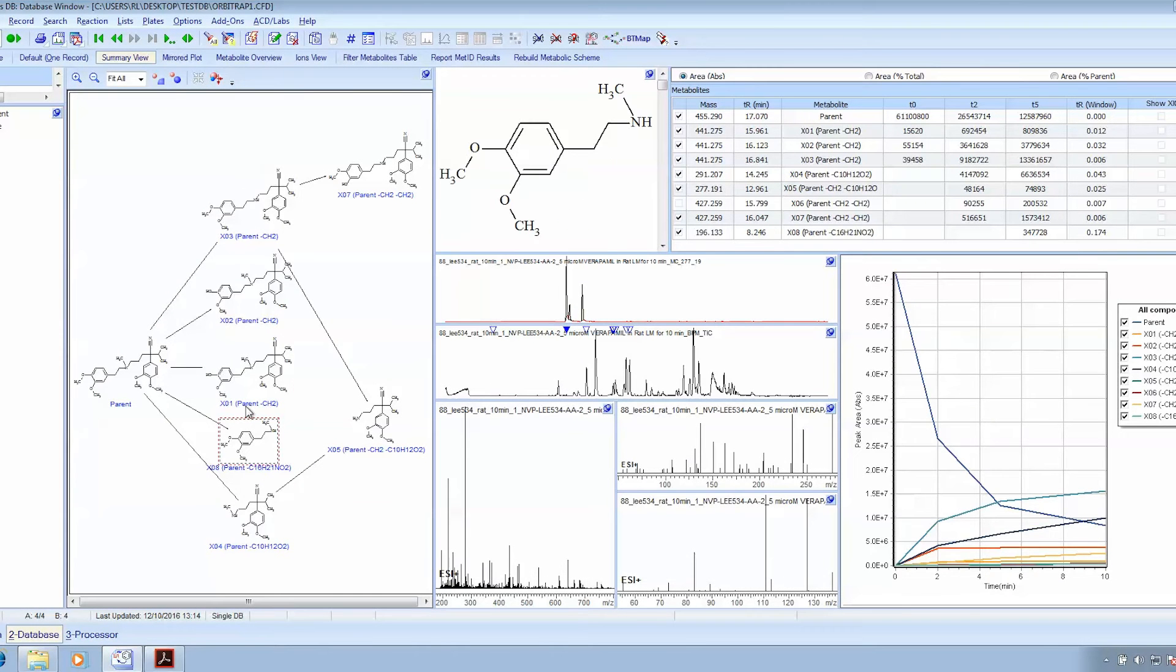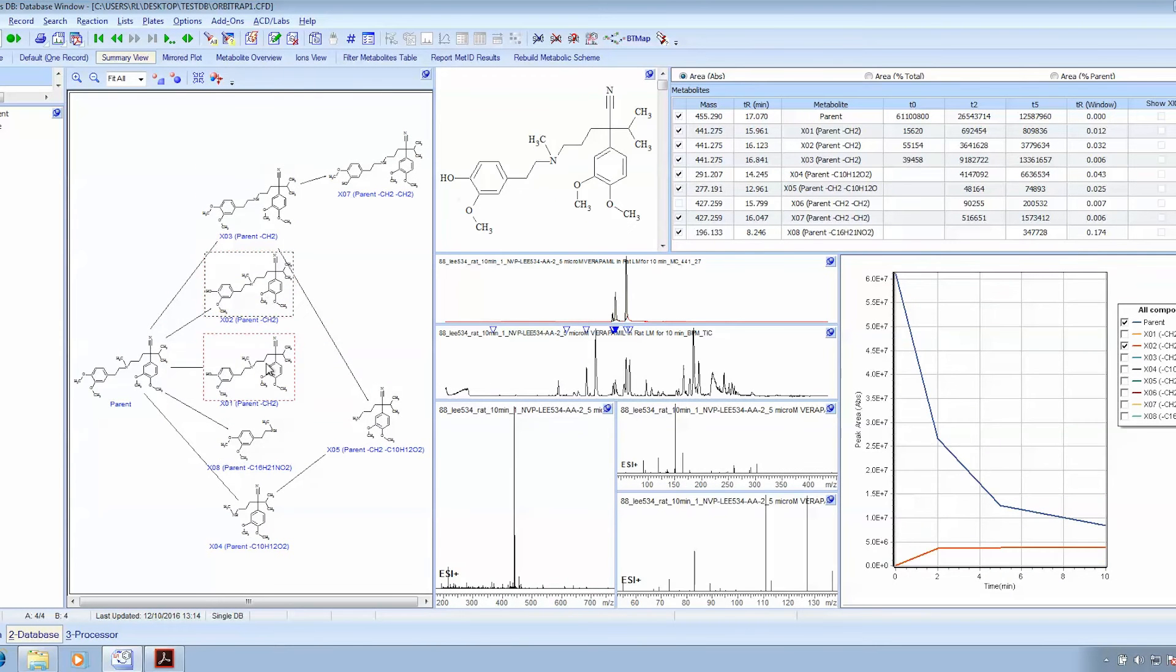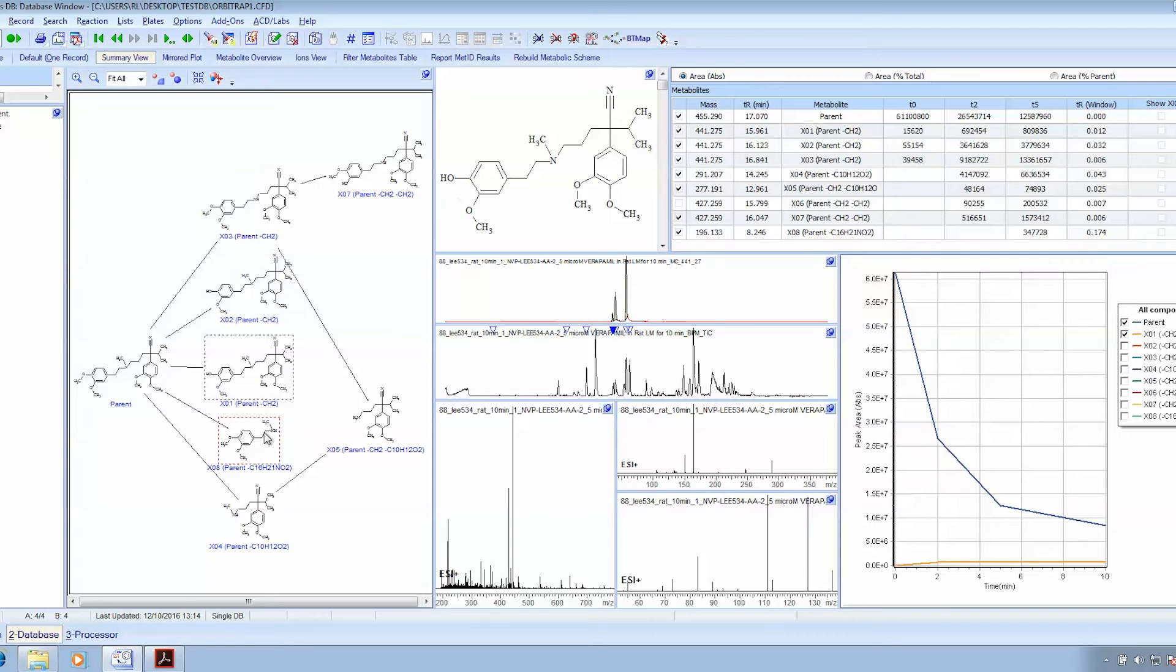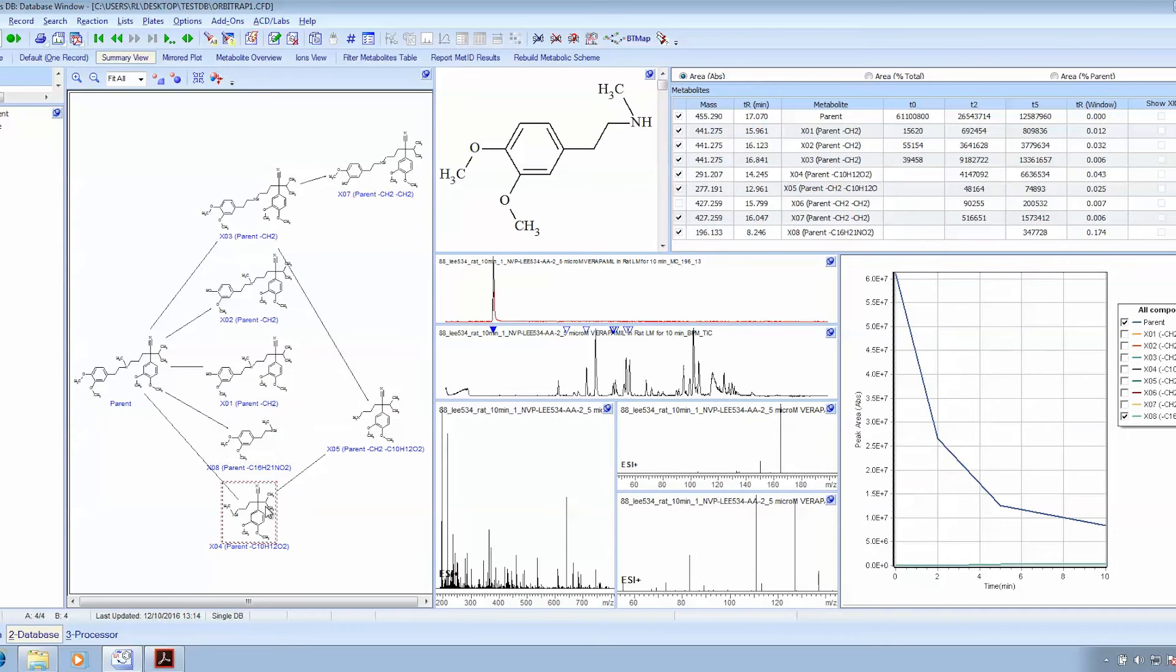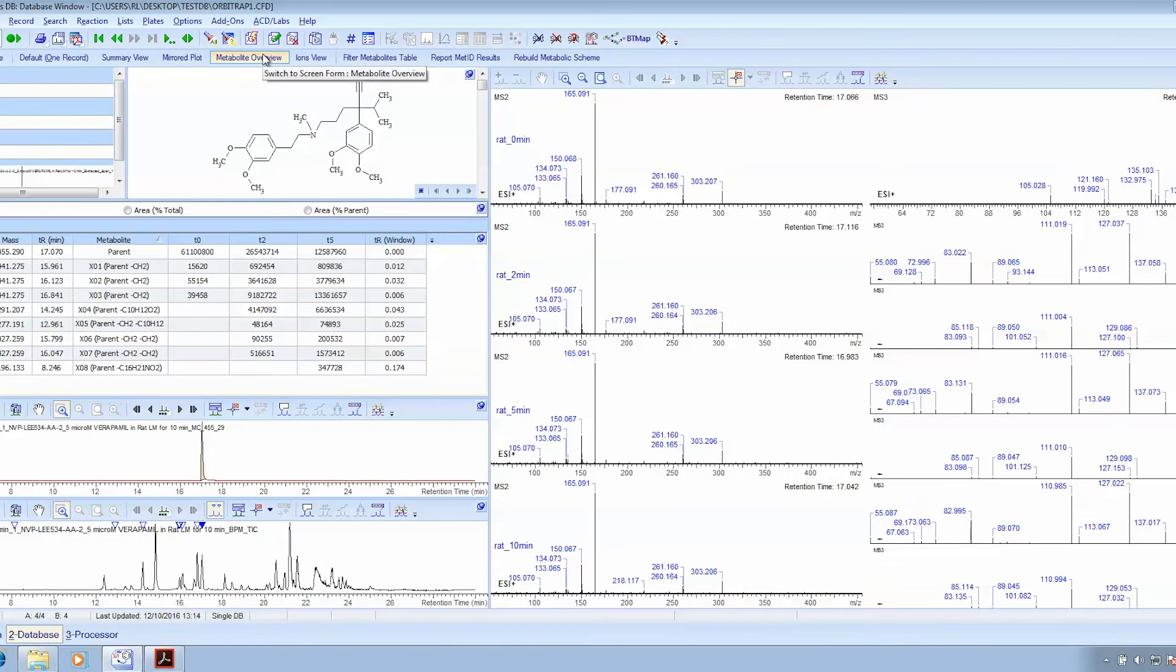This is the SpectrusDB interface. You can see the interactive biotransformation map with all the associated spectra and the interactivity between the map and the kinetic and stability plots. But how do we actually get to this point?